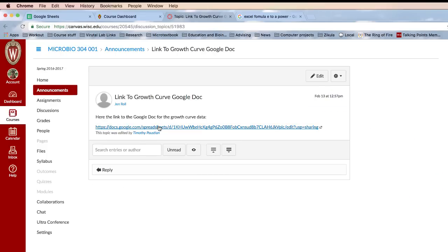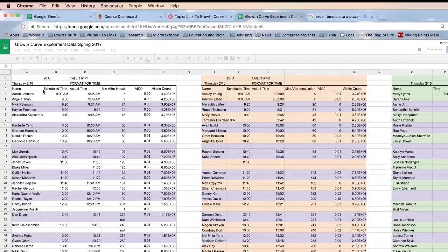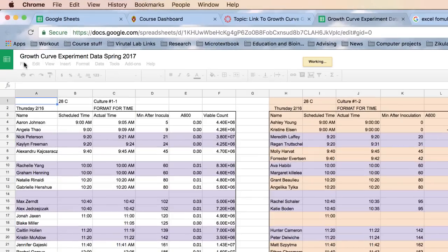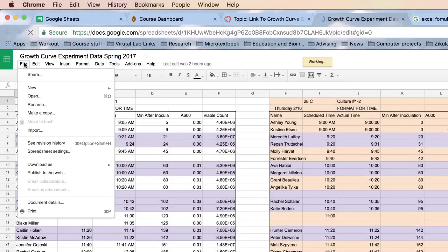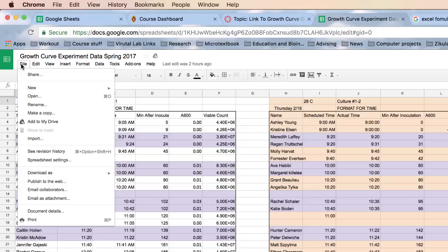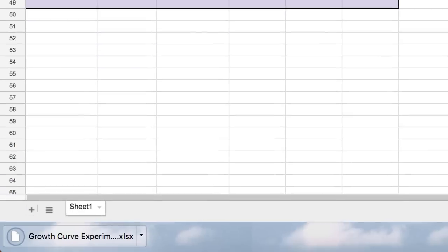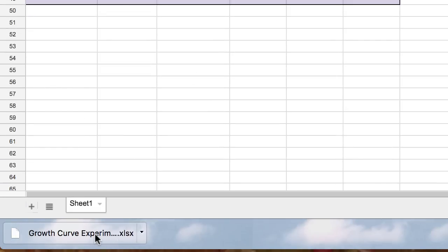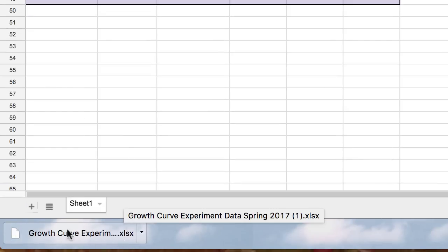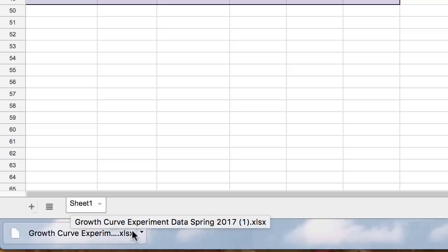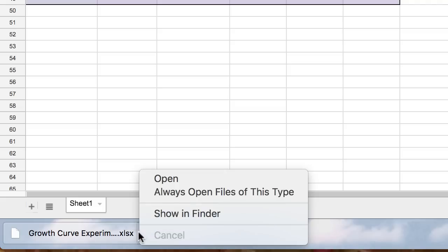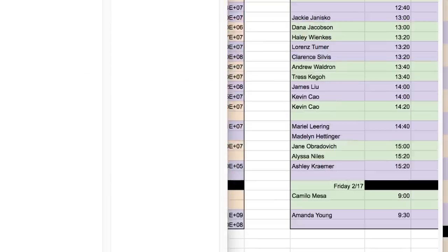Click on the link to the growth curve on the Google Doc. When you get to that data, click on File, then Download As, and select Microsoft Excel. This will download it to your computer. I'm using Chrome here, and you can see it downloaded — I'll say Show in Finder.